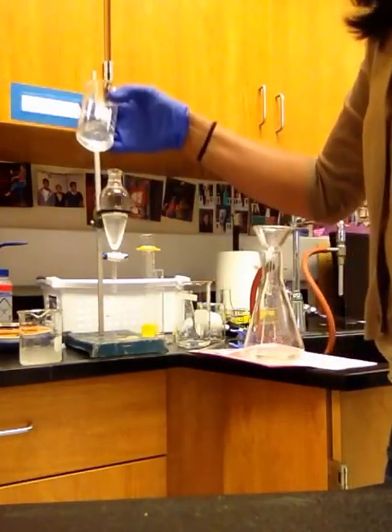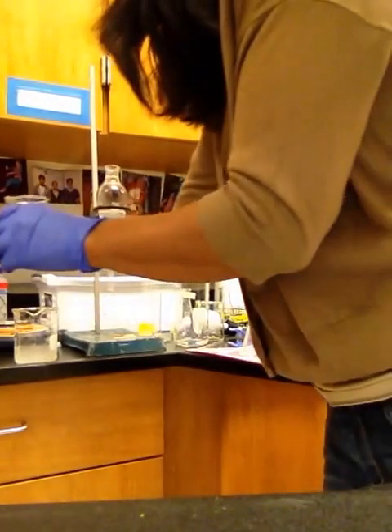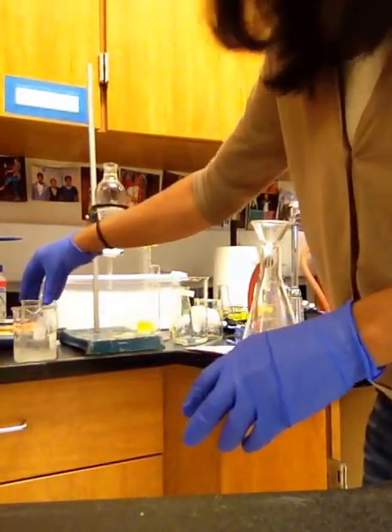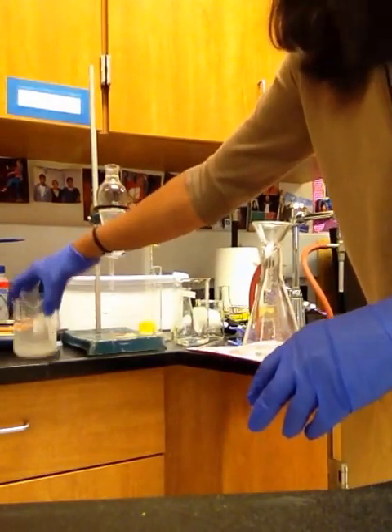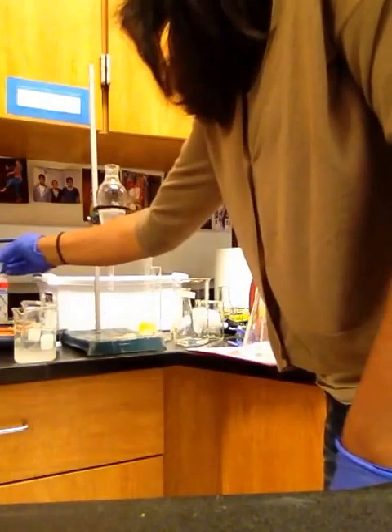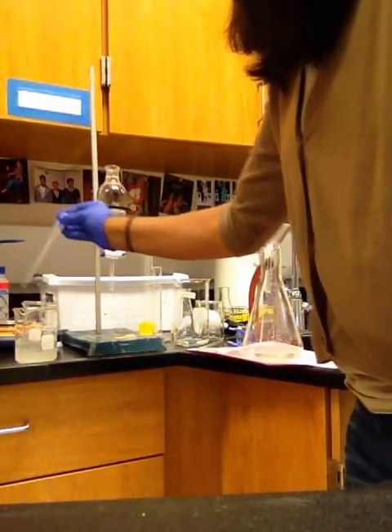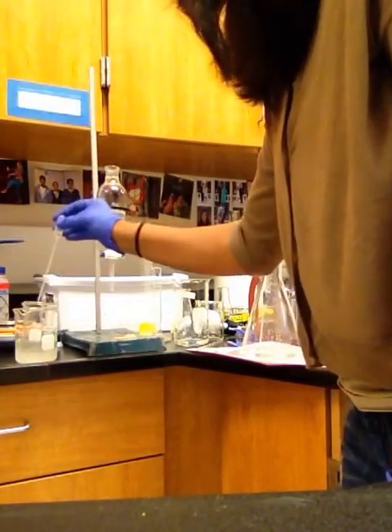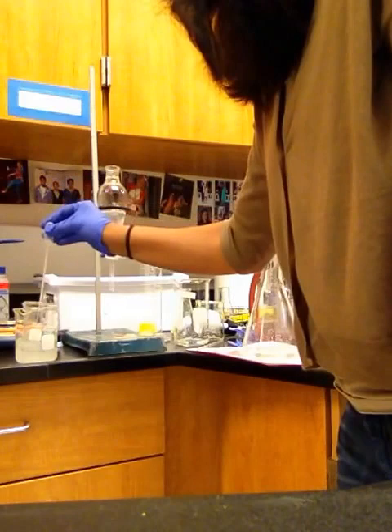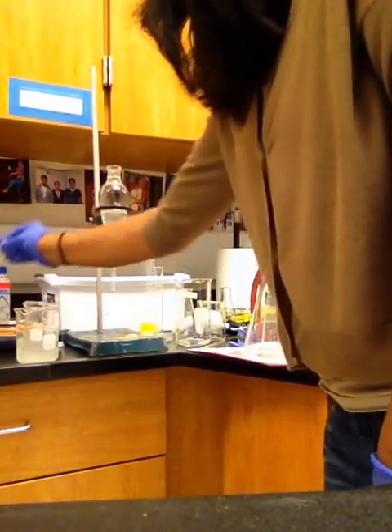Now what you're going to do is, to this aqueous layer, you will keep adding HCl in an ice bath. So you first put your aqueous layer in the ice bath. An ice bath is nothing but a beaker containing ice. And then be very careful with 6 molar HCl because it is highly corrosive. And as you add HCl, you have to make sure to add enough that the pH goes to about 2.